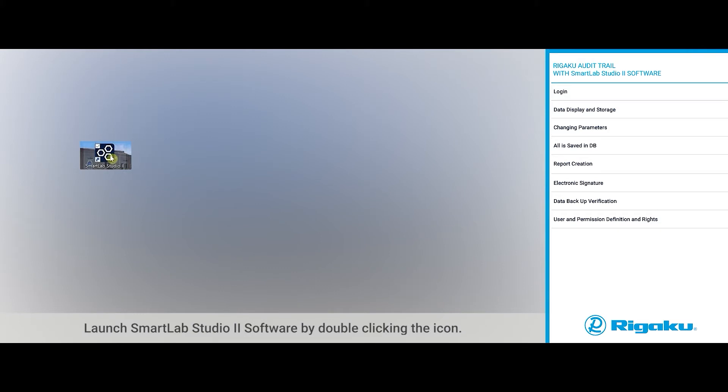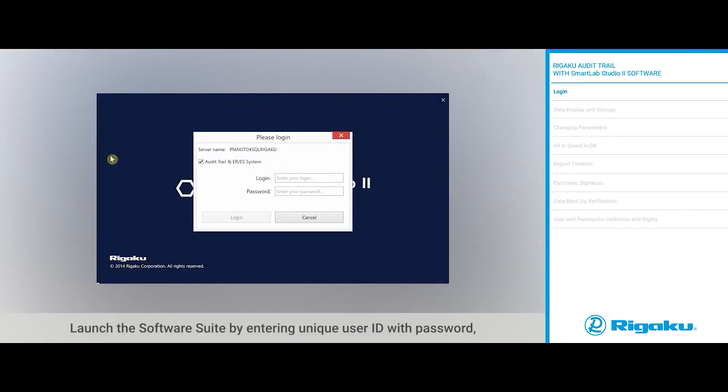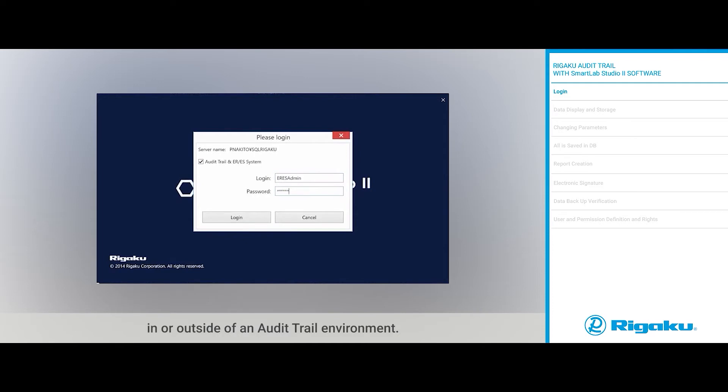Launch SmartLab Studio 2 software by double-clicking the icon. Launch the software suite by entering unique user ID with a password in or outside of the audit trail environment.